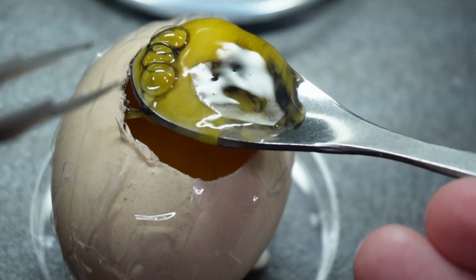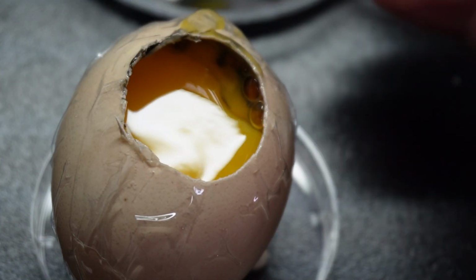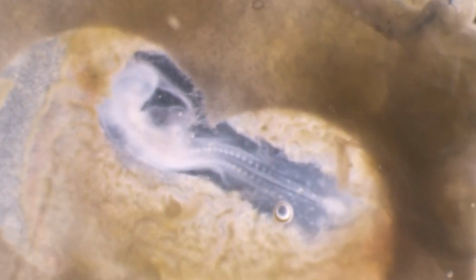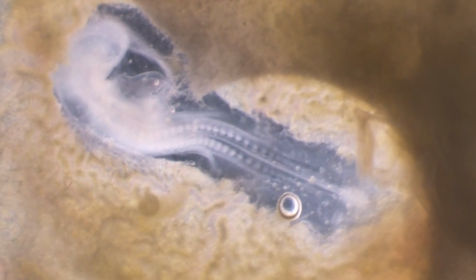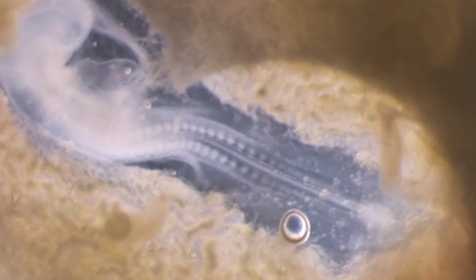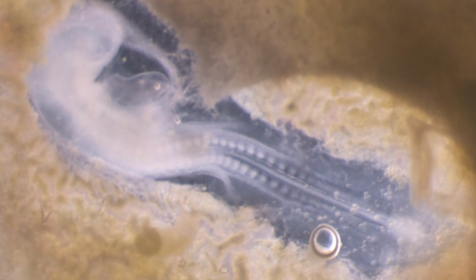That sounds incredibly precise. Needs a steady hand. Okay, embryo is safely in the PBS. How do you confirm its stage then? Now you go back to that Hamburger and Hamilton table. You put the dish under a dissecting microscope and look closely. Counting somites, looking at the eye development, those optic vesicles, checking the heartbeat pattern, all those landmarks together tell you its exact H&H stage.